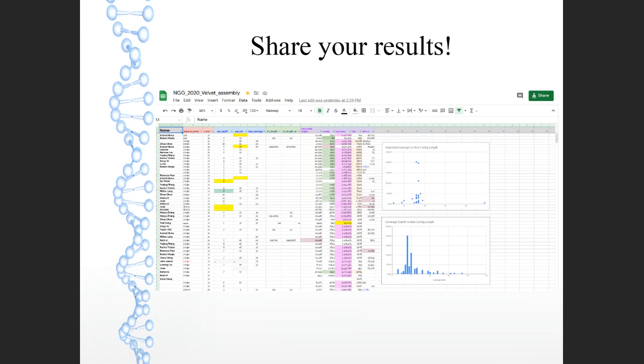As you do that, you'll see your data is added to a graph, and we can see exactly how our different parameters, our different k-mer lengths, whether we're using paired end or single end data, affect the number of contigs we get in our assembly, and ultimately how good an assembly we're going to get at the end of the day. That should hopefully be a bit of fun. Once you've got those numbers, it gives you a comparison as to what the other parameters do as we go along.